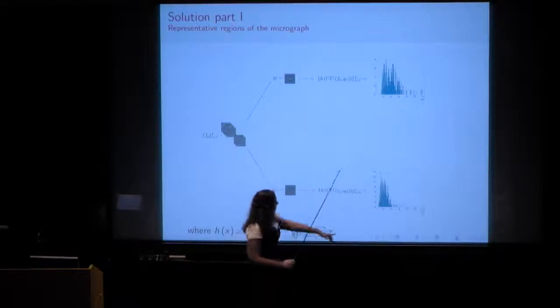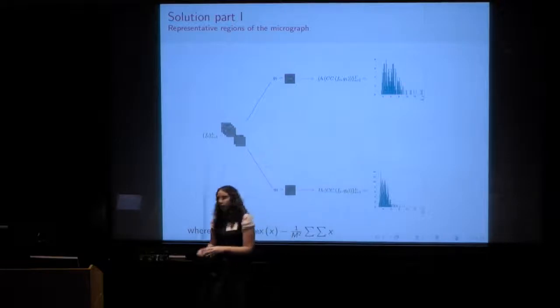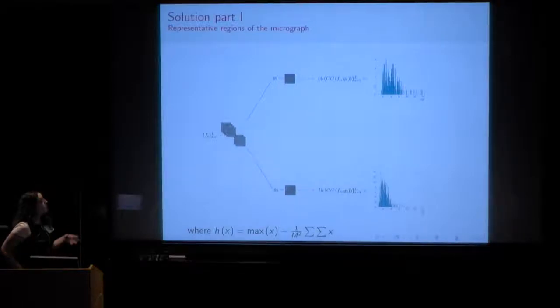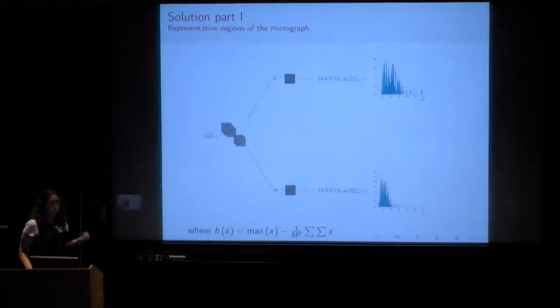And what we can do is just set some threshold, let's say at 8, just by looking at the data, and characterize each window by how many of these cross-correlations pass the threshold. So if one window had high cross-correlation with a lot of the reference windows, it's definitely going to be a particle window, but if it had very few peaks, it's definitely going to be a noise window. And that's how we can decide what's particle and what's noise.